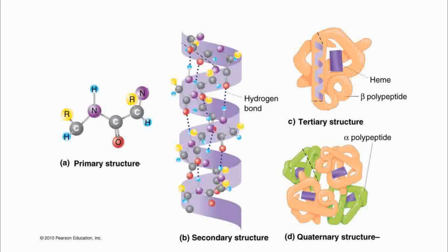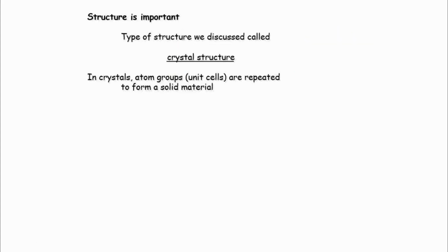Now on the contrary, what we can do is fix this structure into one orientation. So how do we do it? We actually form crystals. When your protein is pure, you change the temperature and crystallization happens. When you make it a crystal, this particular orientation is fixed. Now when I have a fixed structure, it is easy for me to identify or study its structural orientations, right? And that is why it is called crystallography, because you have to make your samples in the form of a crystal, and once it is in crystal form, you put the sample in the X-ray crystallography setup, your X-ray beam goes through, and then your structural elucidation starts. So this process starts with crystallization of your sample, right?